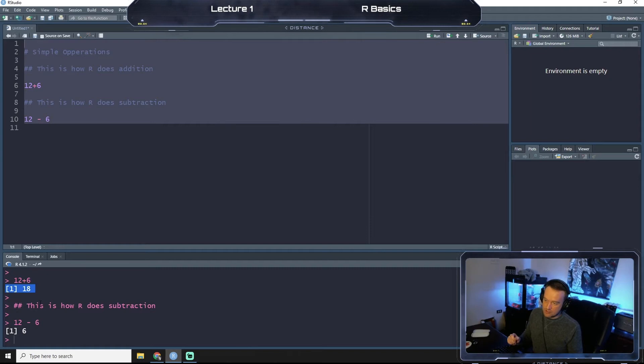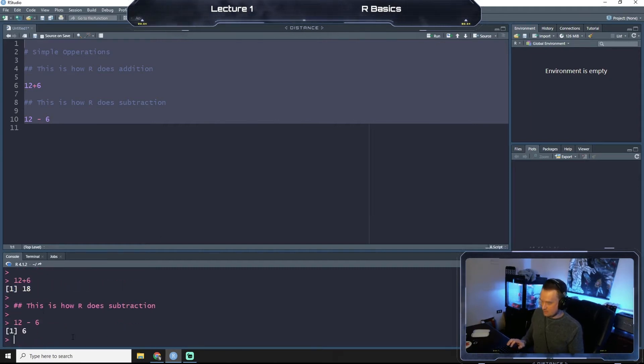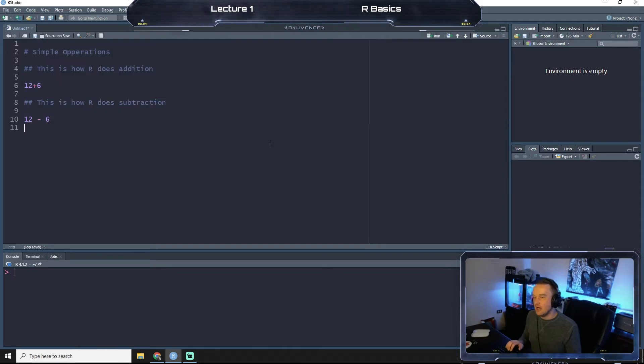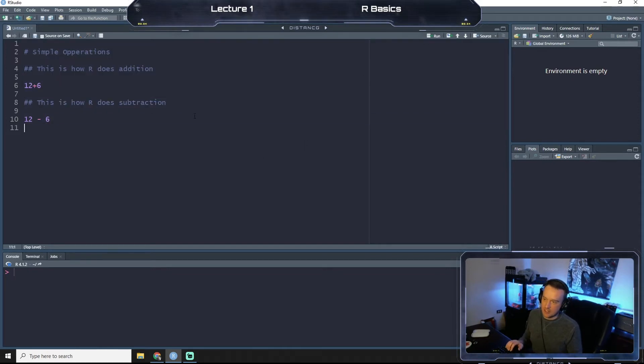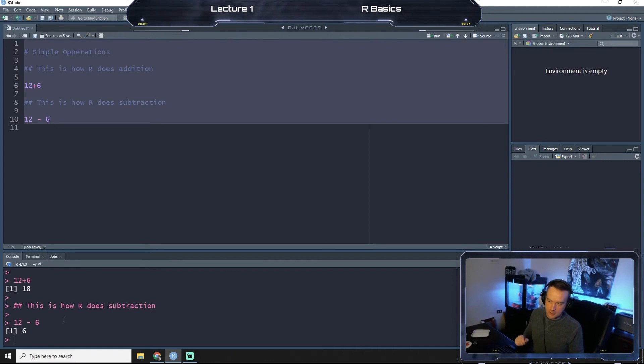It will run both. So if you hit control L it'll clear your terminal. So I'm going to do this so it makes it a little easier to see. So you see it runs both of these codes.